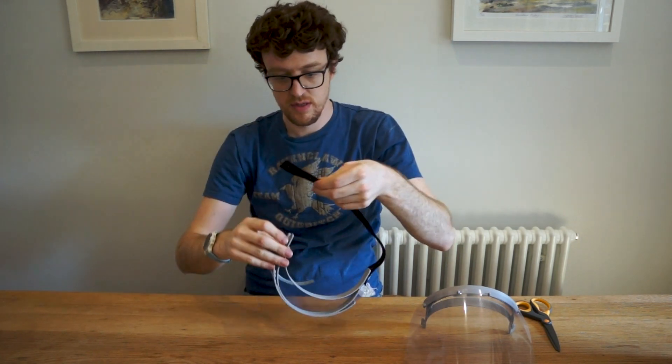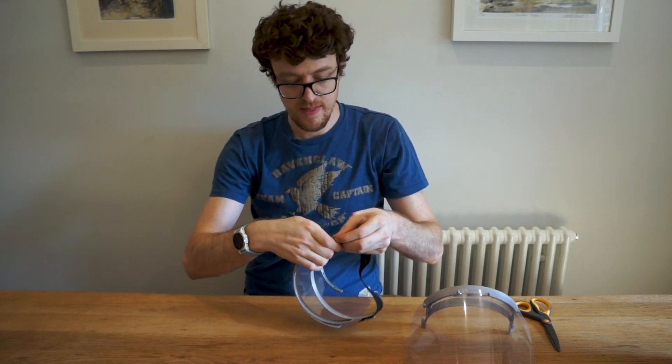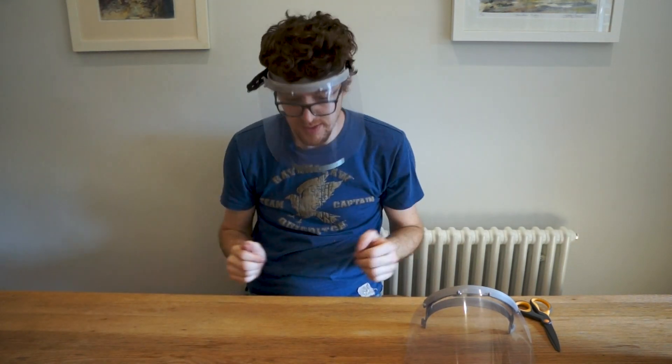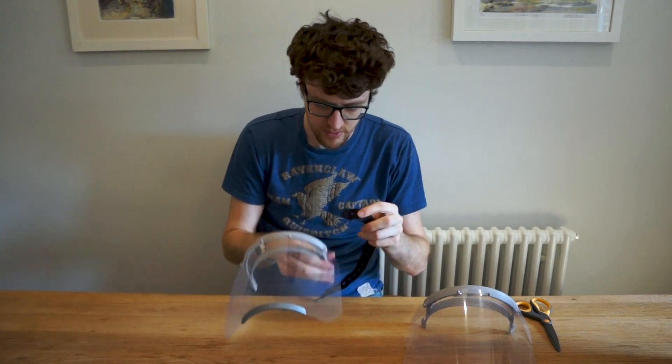Hold it up to your head, put it round, and work out which hole will be a good fit — you don't want it too tight, but you want it tight enough that it doesn't fall off. For me that's there — line that up and pull it over, and you've got the finished face shield. It's quite tight, so that's that one. Now take off that buttonhole elastic.